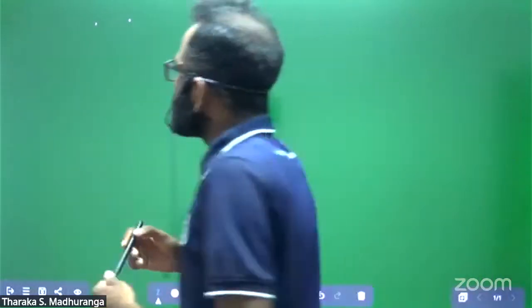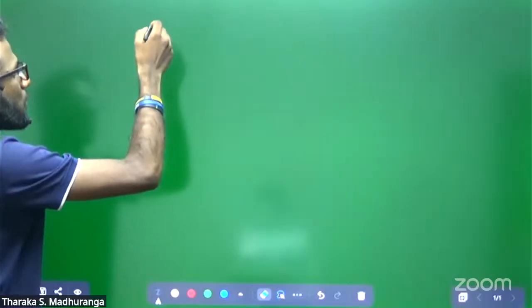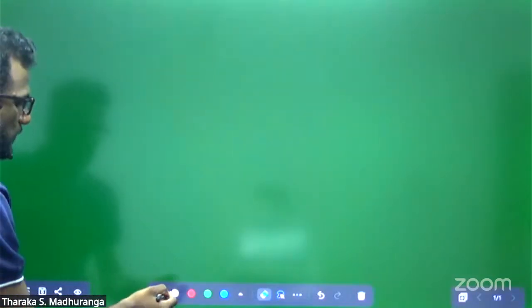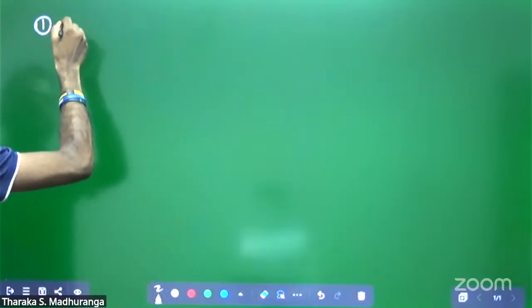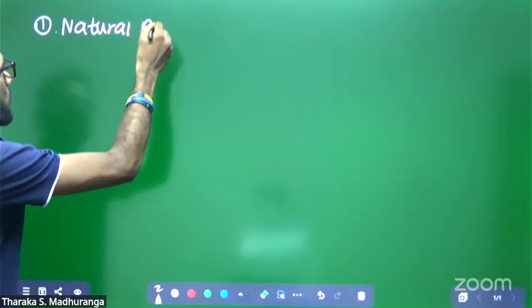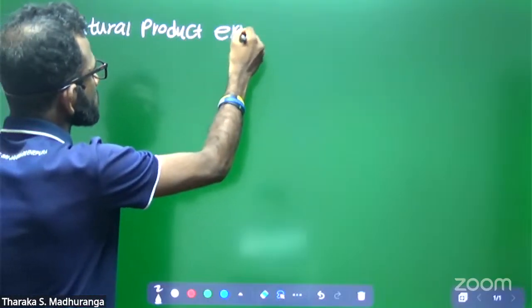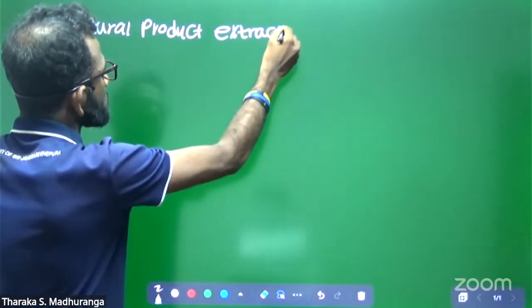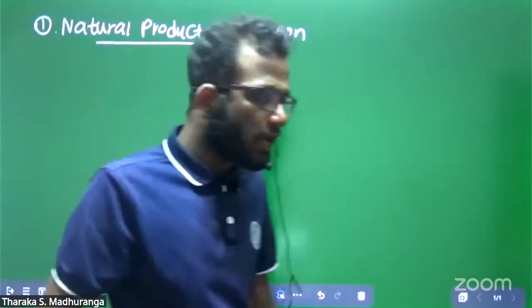Then I told you in this lesson we discuss three main parts. The first step is natural product extraction. The natural products extraction. What are the extraction methods I told you last day? I already discussed two methods last day.